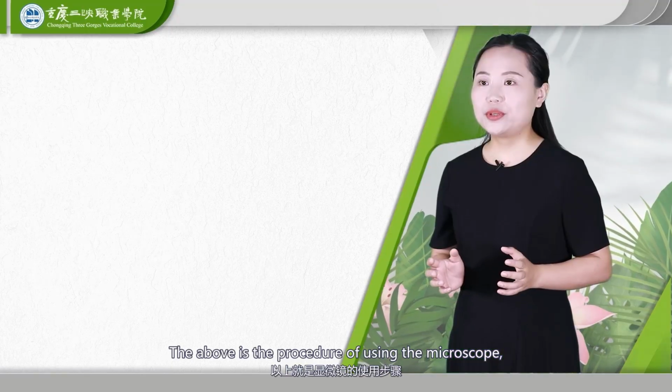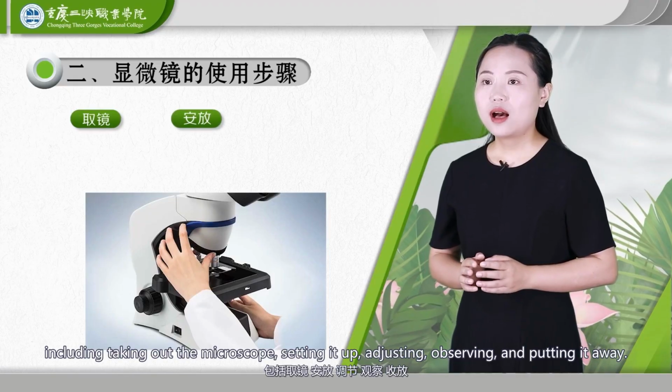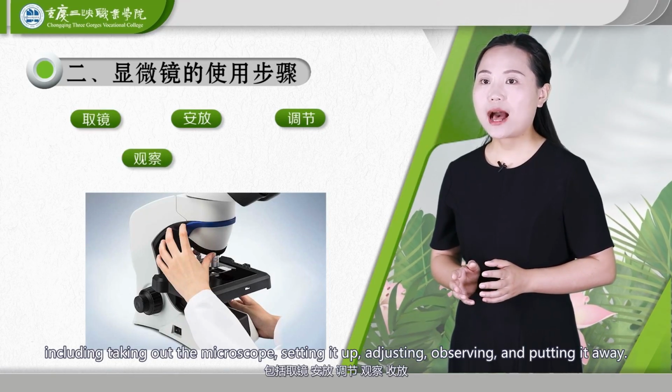The above is the procedure of using the microscope, including taking out the microscope, setting it up, adjusting, observing, and putting it away.